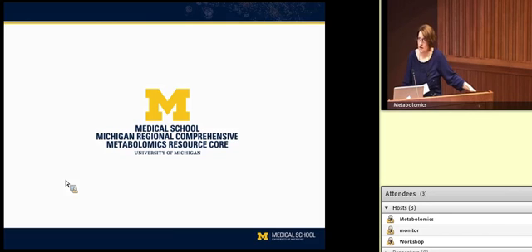Okay. And I would say, in general, we haven't gotten to that level of sophistication as far as doing any statistical analysis on those targeted assays. We're really just doing our best to take the peak area and make sure it's consistent amongst samples. But it's an interesting question. It would be interesting to try, but we don't necessarily get the raw data out of that platform either. It's already been run through a couple of different processing steps, so it would be a little bit hard to go backwards to area from there.